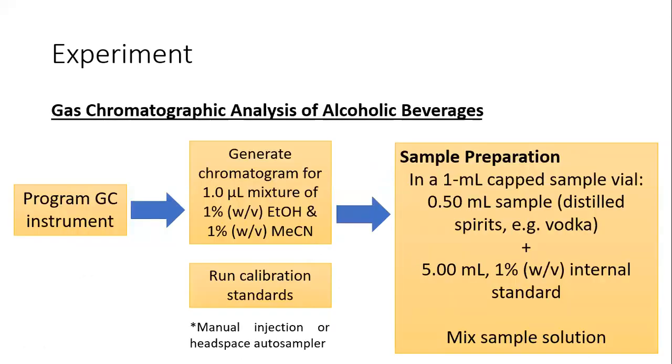So after you program the gas chromatograph, you can now use it to analyze your calibration solutions and the sample solutions. First, you need to run your calibration.